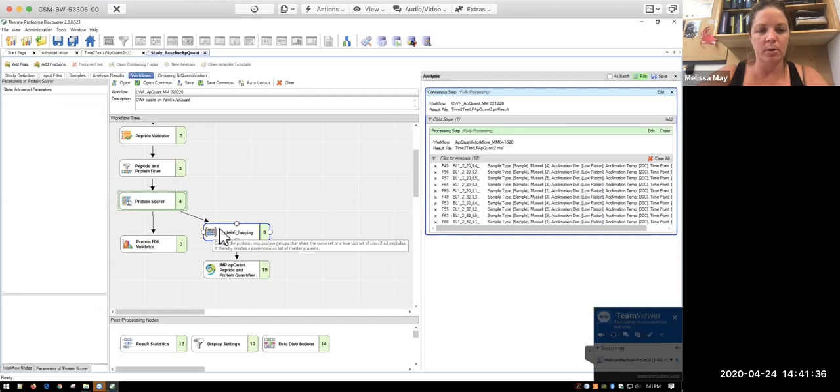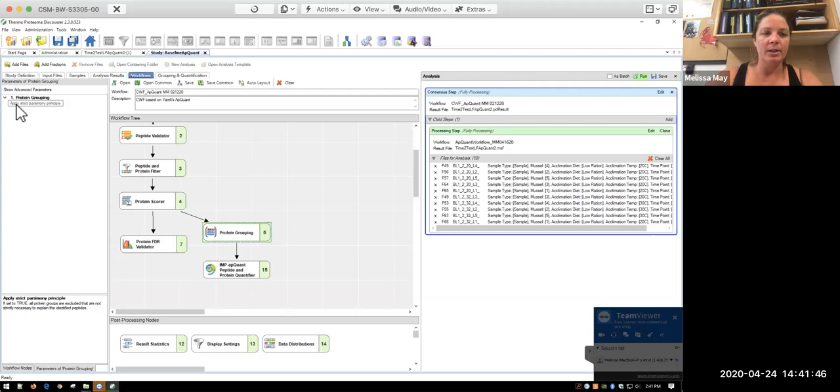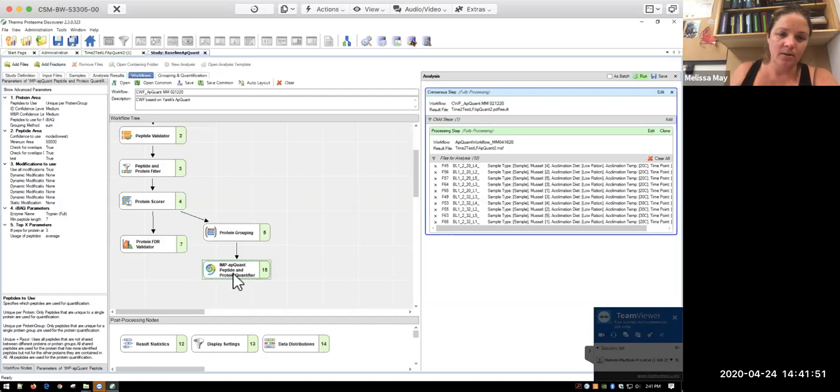And so that gets changed. In terms of protein score, there are no parameters. For your protein false discovery rate validator, again, you just have your confidence thresholds that you set. And then for protein grouping, we apply strict parsimony principle. So that's true.